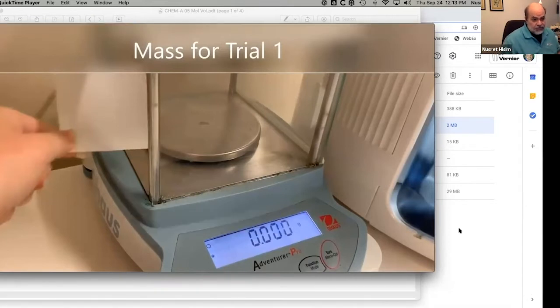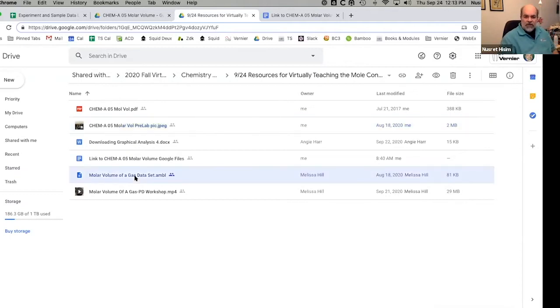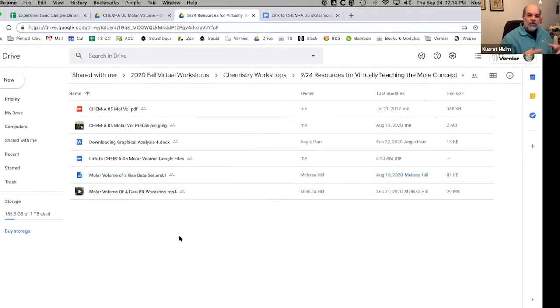In that same shared folder is a data file — a Graphical Analysis data file. These files all end in the four letters AMBL. That's a Graphical Analysis file. You'll need to download this file onto your device if you haven't already. If you want to follow along, download the file. What I'm going to do is open that file so we can look at the data while the experiment is progressing in the video.